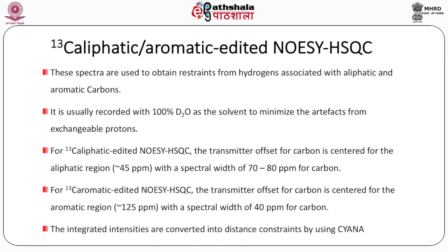Generally, amide protons are exchangeable. Therefore, when you put D2O in the sample, you actually lyophilize the sample and rehydrate it with 100% D2O or 100% D2O buffer. Then what happens is that the amide NH get exchanged, and so they do not give any spurious peaks in the spectrum, so that the spectral width can be shortened and one can only look for the CH aliphatic region or the CH aliphatic to CH aromatic.